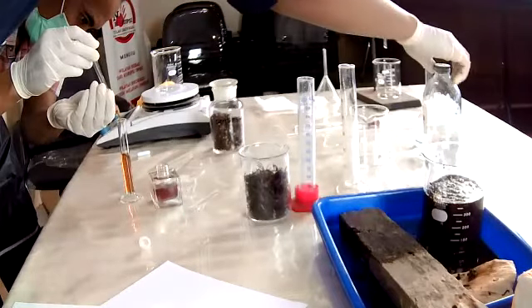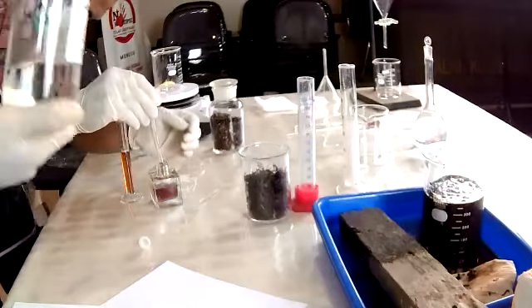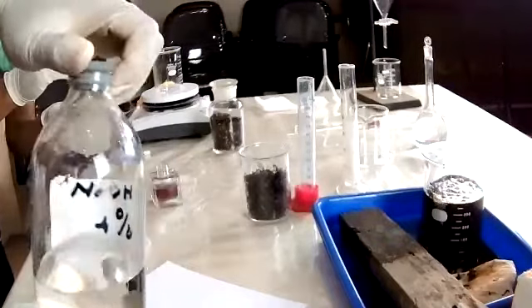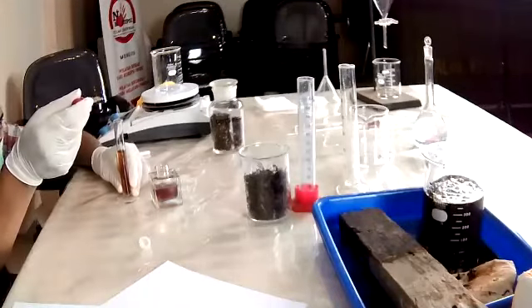And we're going to treat this with the natrium hydroxide or with the lye, NaOH, 4%.